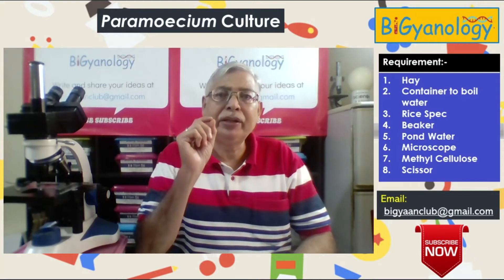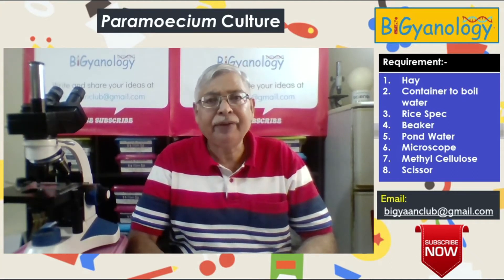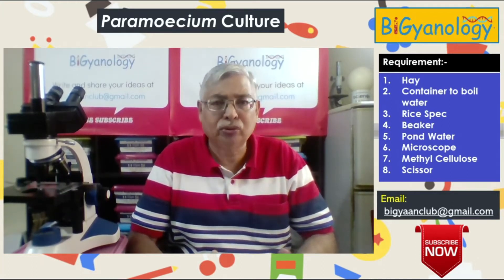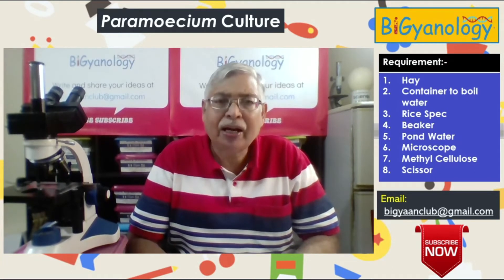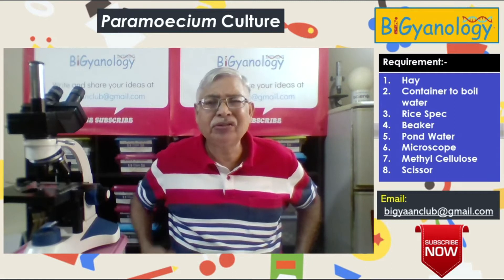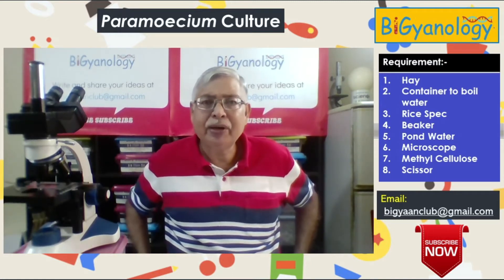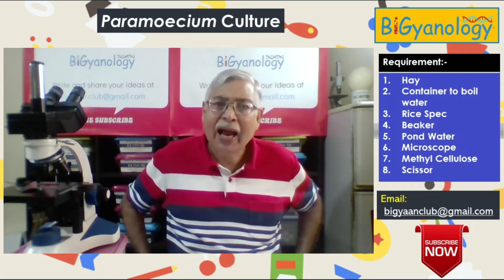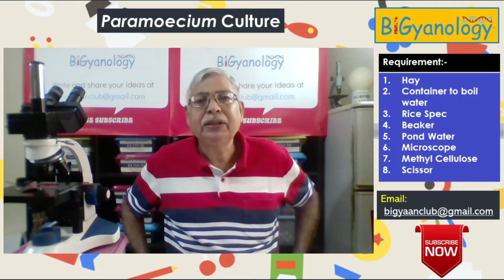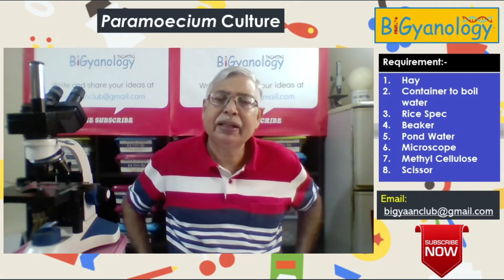Paramecium is a small unicellular organism, very difficult to get, very difficult to catch, very difficult to show to students. Now the advantage is the moment we do culture, we get thousands of paramecium in one place. So easy to handle, easy to show, and with the help of a microscope at high power, we can even arrest them and show their ciliary movement easily.